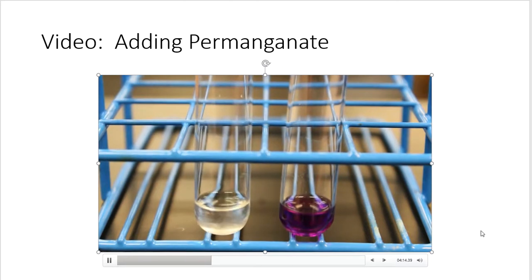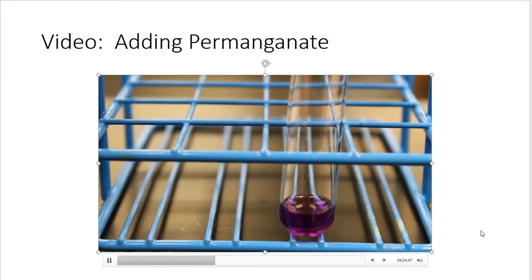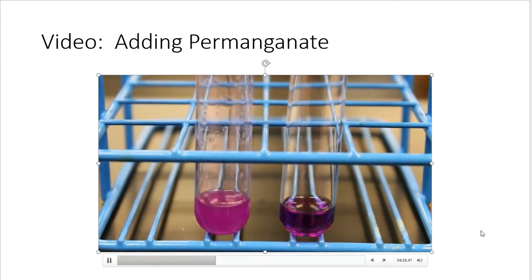1 ml of acetone. I'm just going to add the drops in. We start off with 2. 1, 2. What do you think? And now I'll just keep adding. You can count them on the screen. I'll just go to 20 just to go to 20.